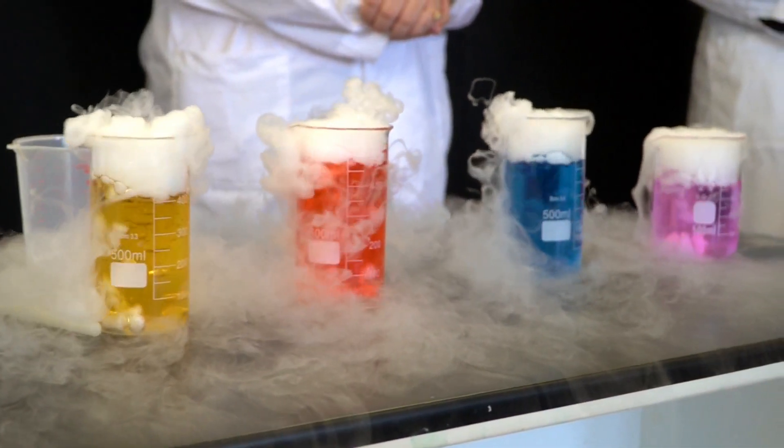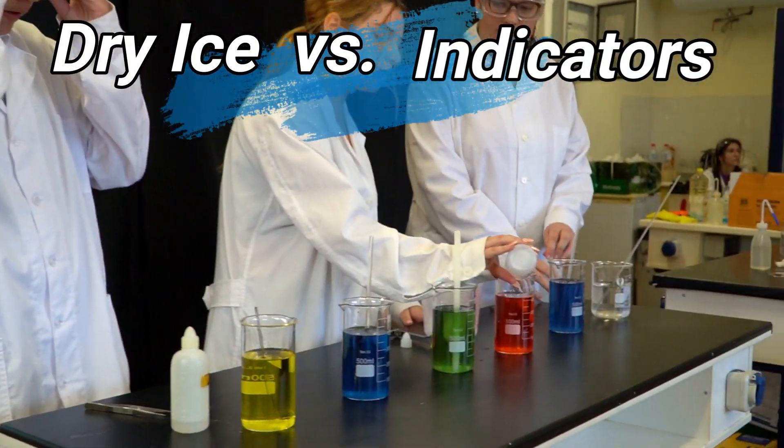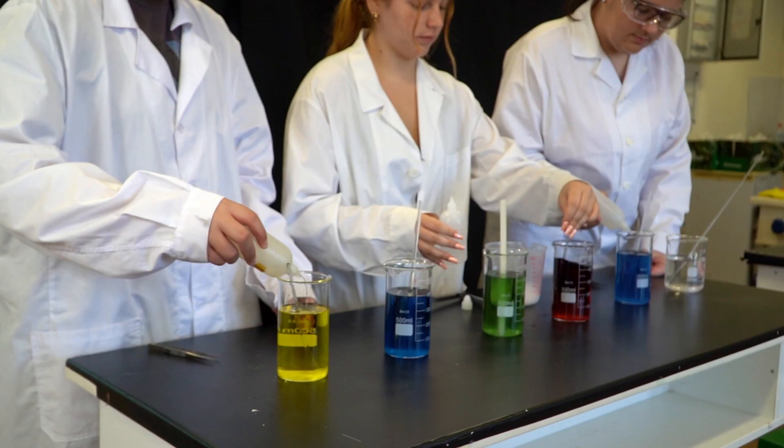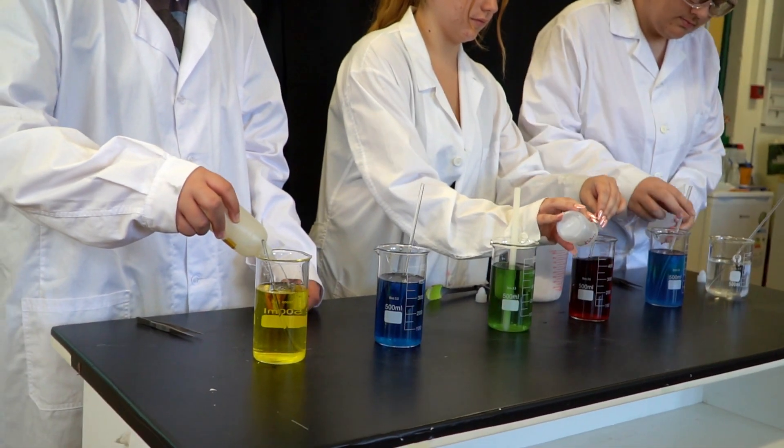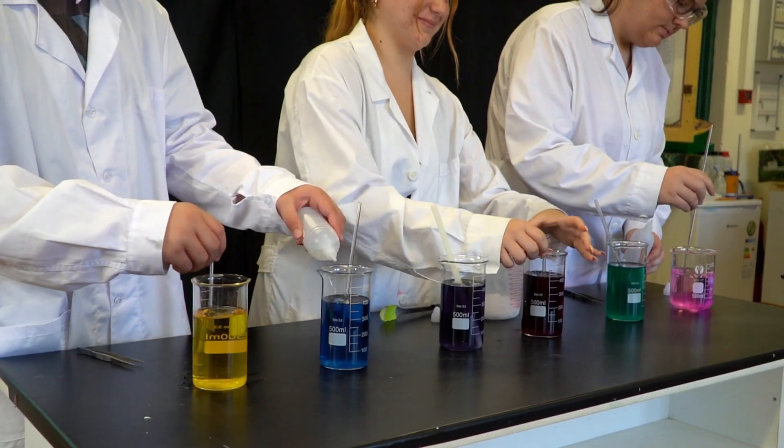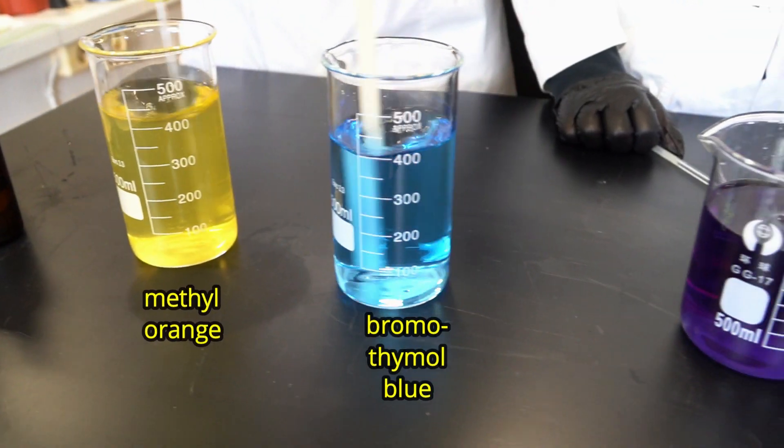pH indicators are water-soluble substances that change color according to how much basic or acidic the solution becomes. In that particular experiment we prepared alkaline solutions of six different indicators and followed the color changes while pH decreases slowly.